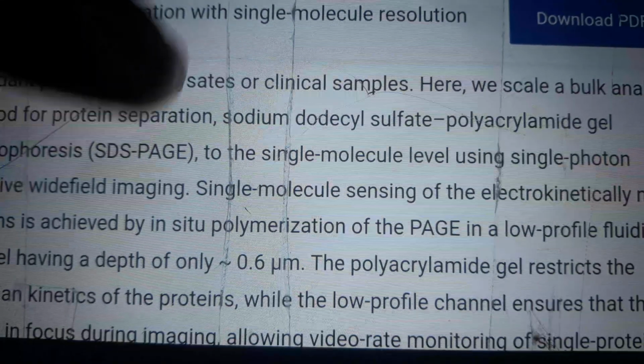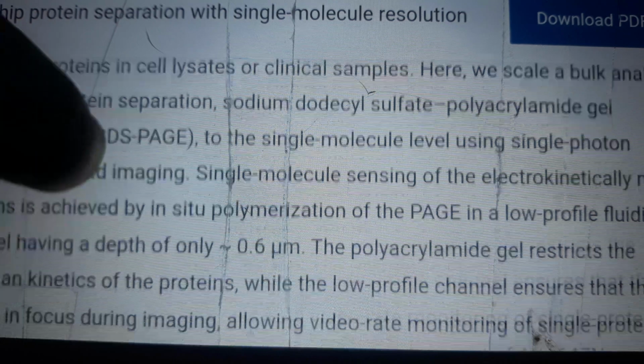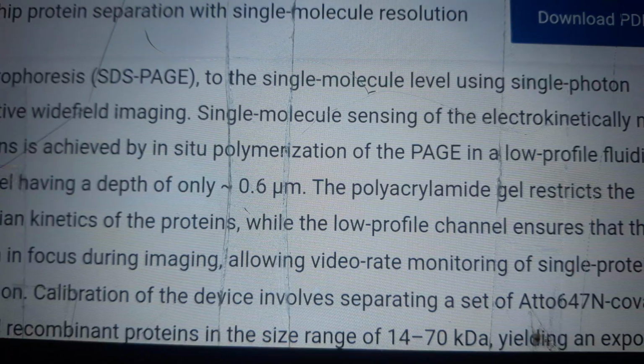Here we scale a bulk analysis method for protein separation, sodium dodecyl sulfate polyacrylamide gel electrophoresis, SDS-PAGE, to the single molecule level using single photon sensitive wide field imaging.